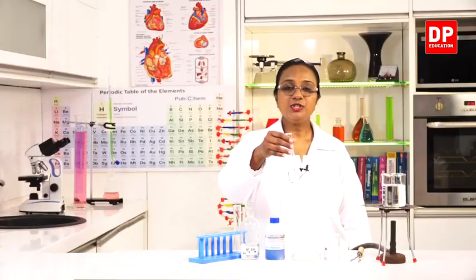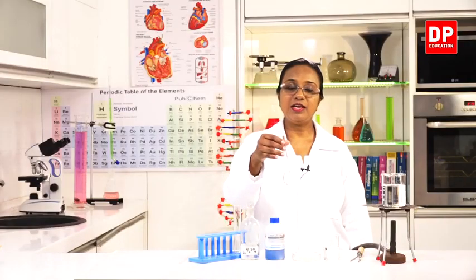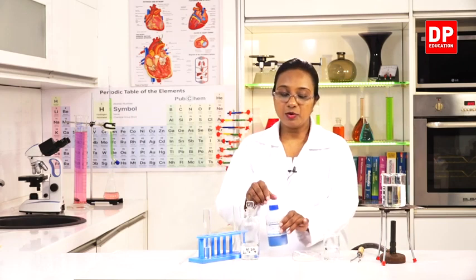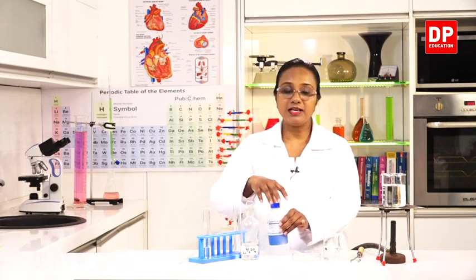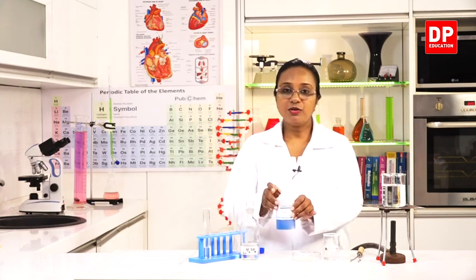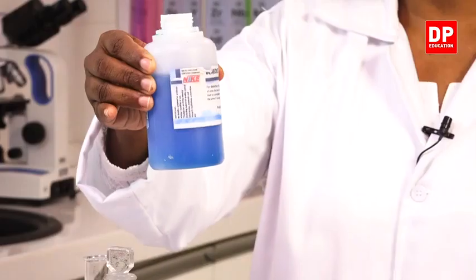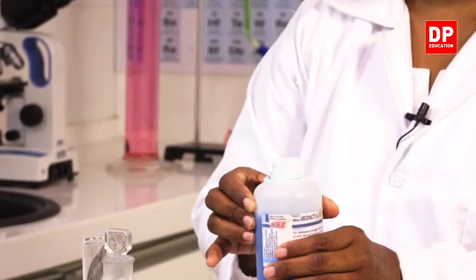Now that the sugar has dissolved well and we have the sucrose solution ready, to this I will have to add a small amount of the Benedict's solution. We have used it before also. You can see the color clearly. It is a blue color solution.